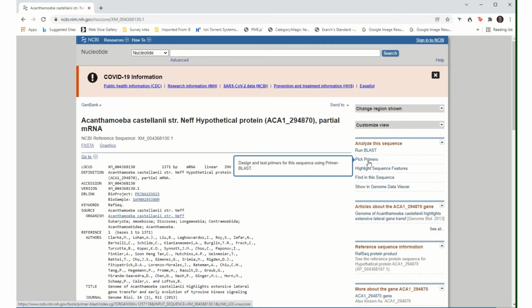From time to time, the NCBI web pages may change, so this may look slightly different from the video that I'm recording today, but that's fine. Navigate through, and all of the basic information that NCBI provides will still be there. It may just look a little different.